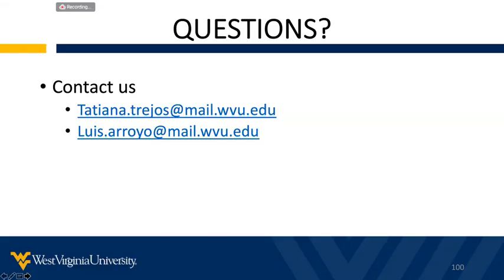Okay. Nicole is asking, what LIBS instrument do you use and how much does it generally cost? We are using a LIBS system from Applied Spectra. There are different configurations for LIBS systems. The one that we are using has a UV laser, 266 nanometers. In terms of price, in general it is in the range of $100,000, but it really depends on configurations.